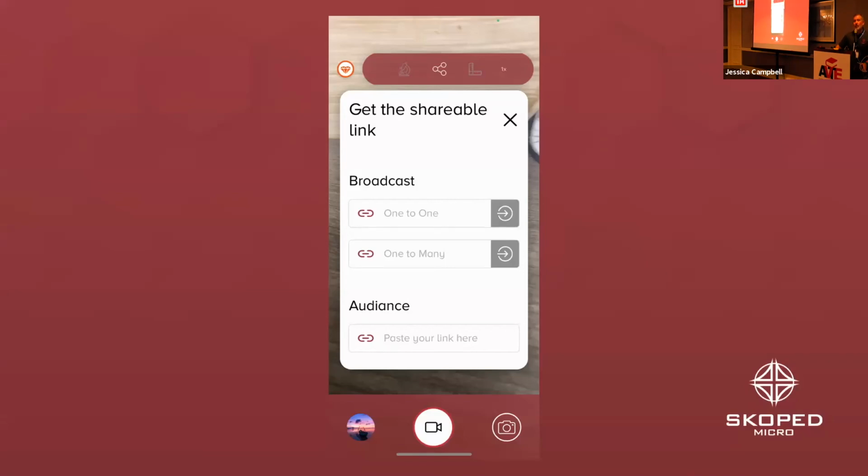That's why I thought I wanted it as backup. What we were looking at would give you a percentage of how much it believed it to be, so if you're like, is that a coccidia? And it would be like, I think it is. If you don't have somebody there to ask, you could ask it. And if it says no, or 20% chance, then you probably got to keep looking. But in my mind, me personally, I would want to use it more as a backup, but as a training modality, it'd be great.